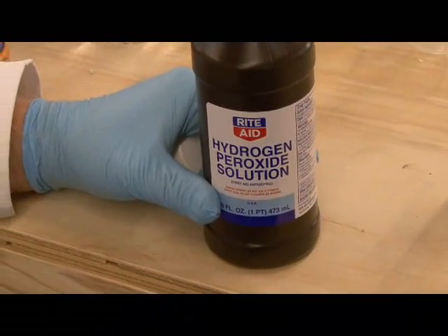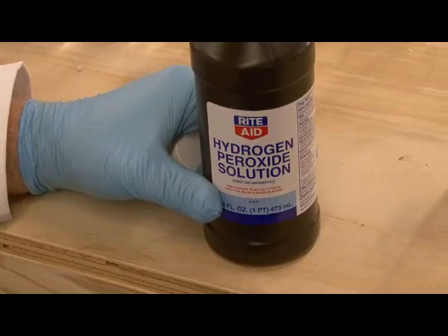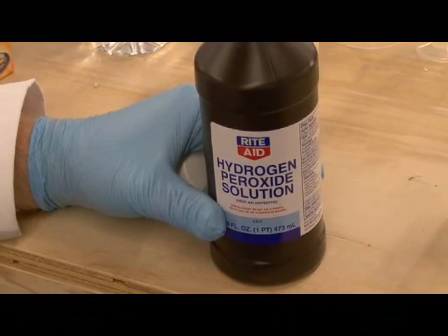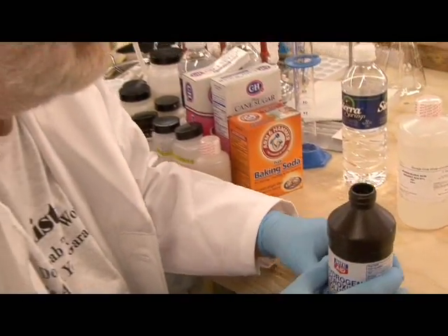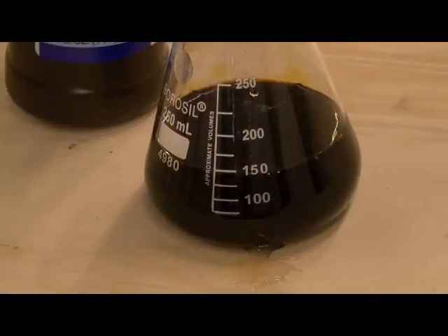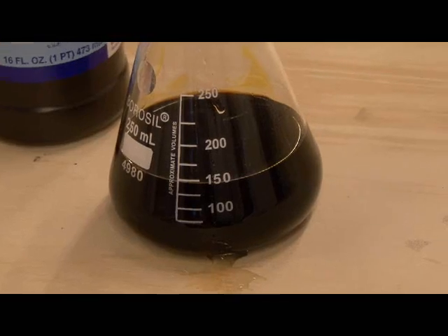Then we take some hydrogen peroxide — just drugstore 3% hydrogen peroxide. We could use any number of other oxidizers that are common around the house, including laundry bleach, stuff that's not difficult to get a hold of. We add a little bit of this, and we see what looks like a brown solution.